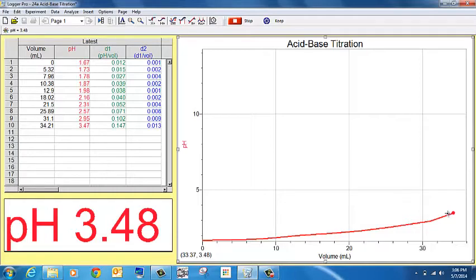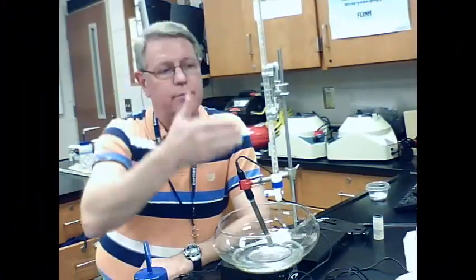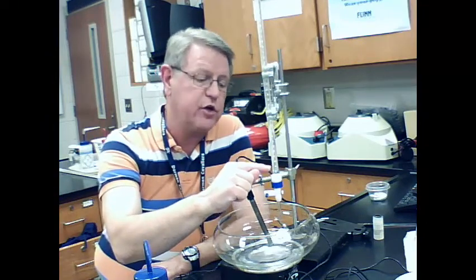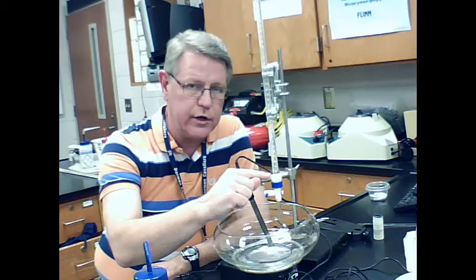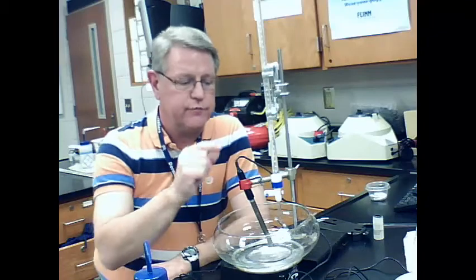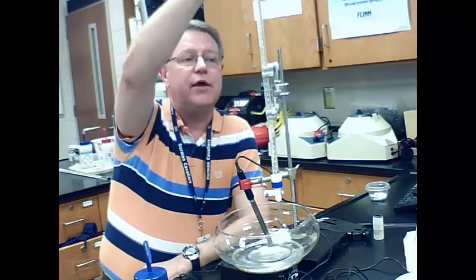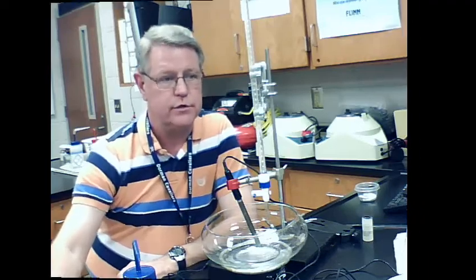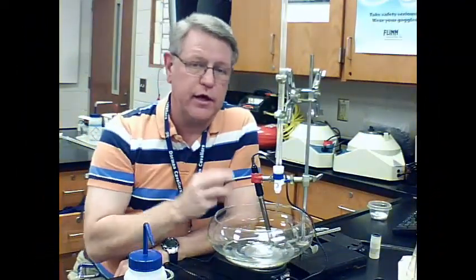which is called the equivalence point, the almost vertical part of the graph. So I completely emptied out the burette of the titrant. I was very careful to make sure that I didn't go past the 50 mark down here. If you go past the 50 mark, there are no more markings down here to actually measure the volume of titrant you're putting into your analyte. So I was very careful to make sure I stopped at 50, and then I made sure I refilled it up to exactly the zero mark. I'm ready to restart. As I add more of this titrant into the analyte, I want to make sure that I put in the logger probe whatever the new value is plus this 50 milliliters. And for this particular acid, I had to refill the burette a third time.